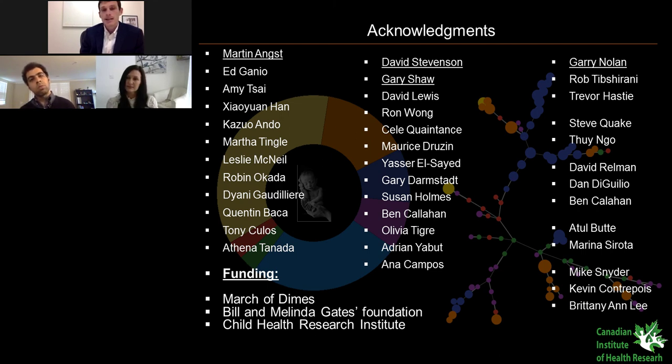And I want to emphasize this part, that the ability to collect quality samples in many patients and in remote locations is really paramount. And the quality of the data set in the end is something that sometimes is overlooked, and we think that with doing a whole blood assay we can really generate a data set of very high quality.